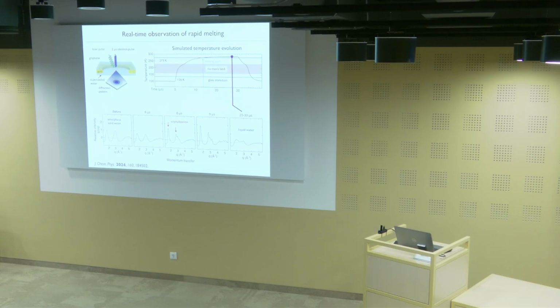Right, so what we learn here is that during laser flash melting, our sample partially crystallizes. Now, that doesn't seem to do anything to our protein structure. However, it's something that maybe we would like to avoid. Right? You could imagine you have a loosely bound protein complex that might be ill-affected by this transient crystallization. Right? So the question essentially would be, is there a way to go more rapidly through this no man's land of water here?